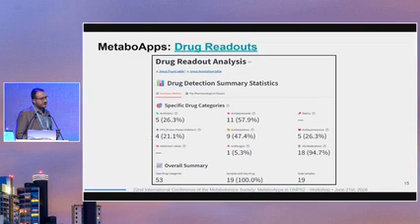So for the drug readouts, we have a really long mass spectral library of MS/MS data that is based on drugs, drug analogs, and also some potential drug metabolites. You can also have access to this library in the publication. So if you want just the library, just to check the spectral data and not do the whole workflow on the app, and use any other software or work directly on your job, you can also do that.